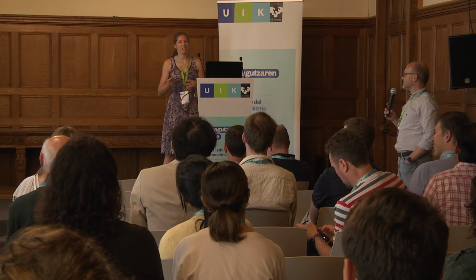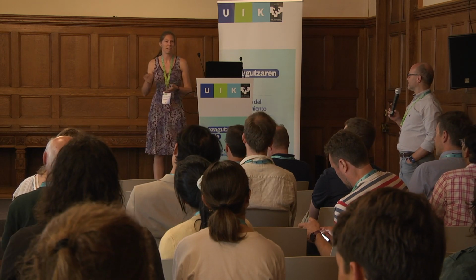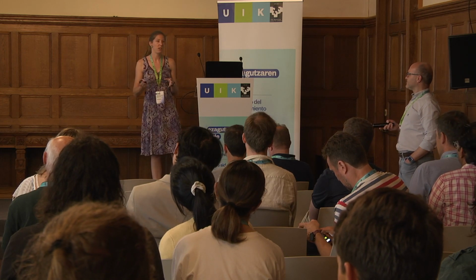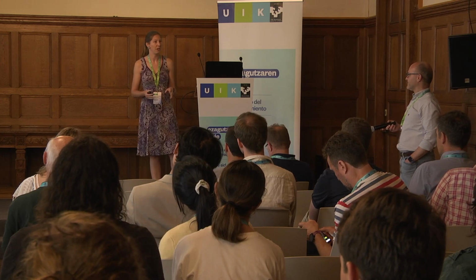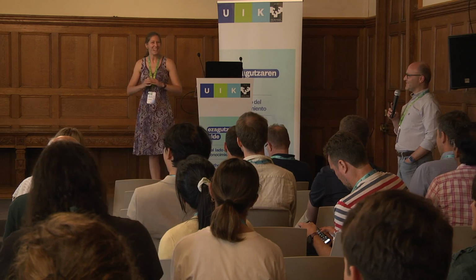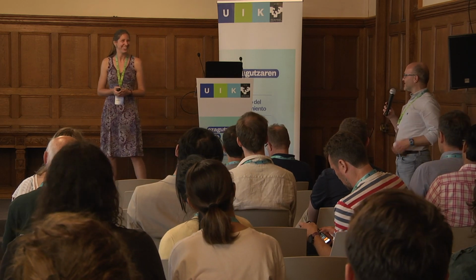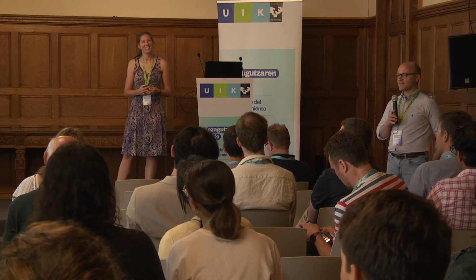So it's really depending on a lot of things. If you want to use a different reference, also if you take a reference image, you should make sure that you take all the images with the same parameters, with the same tip on the same day. So make everything as the same as possible. Yeah, one next to the other, on the same scan. Exactly. Other questions?